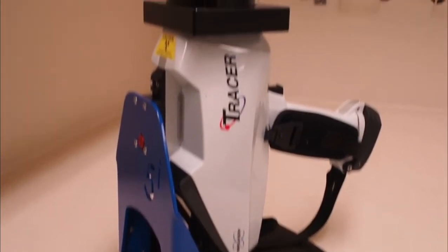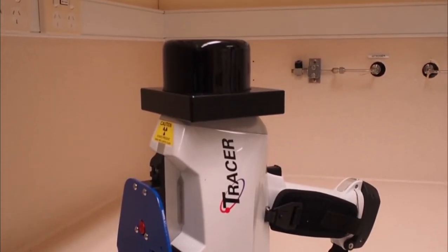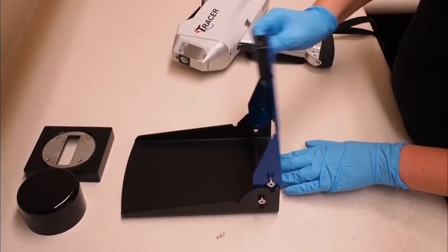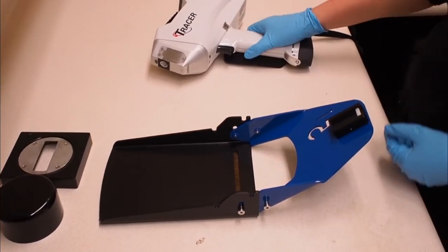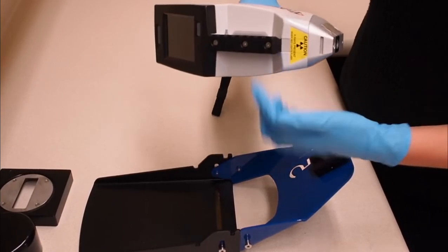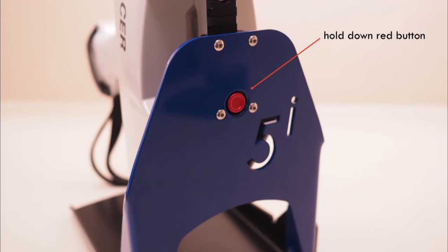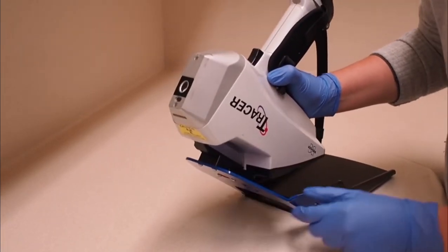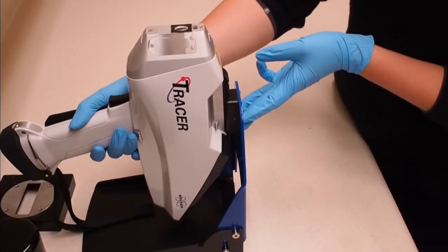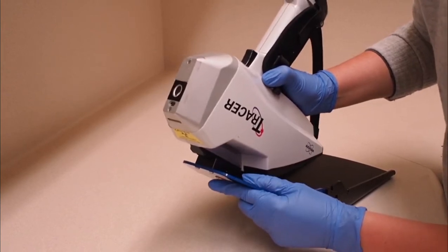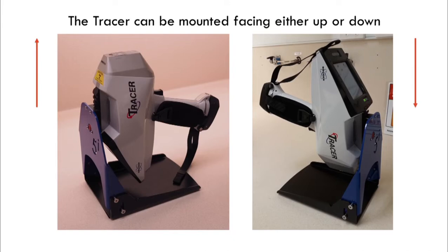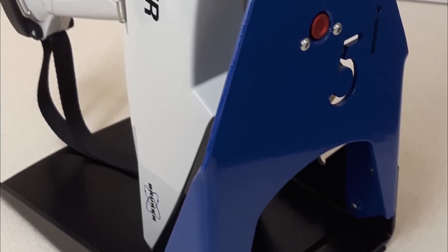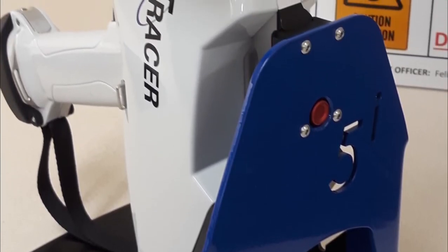If your sample is small enough, you may be able to operate the tracer using the mounting stand and sample stage. Set up the stand by lifting the blue component up and then unfolding it all the way. To set the tracer on the stand, depress the red button on the blue part of the stand to pull back the white clip on the other side and then slide the ridge of the instrument into the slot. When the instrument is at the right spot and height, release the red button. The instrument should click into place. You can position the tracer in the stand with the measurement window pointing either up or down. Move the blue part of the stand into a vertical position for analysis. Please be mindful of any cables getting caught in the stand.